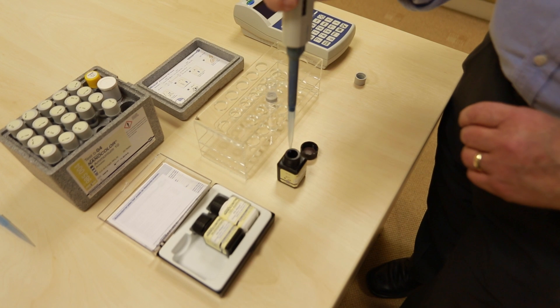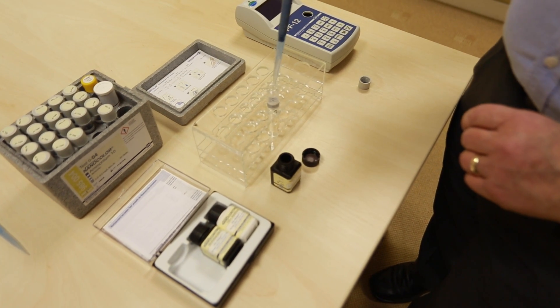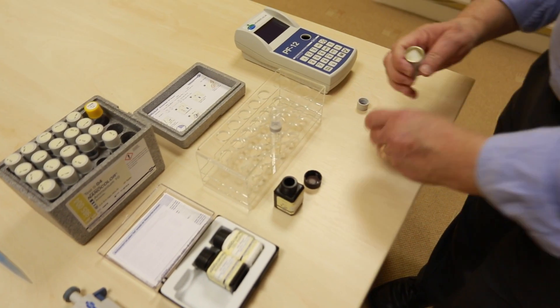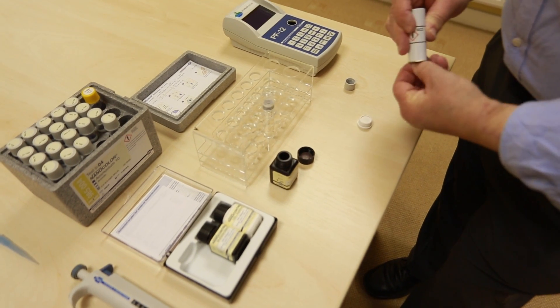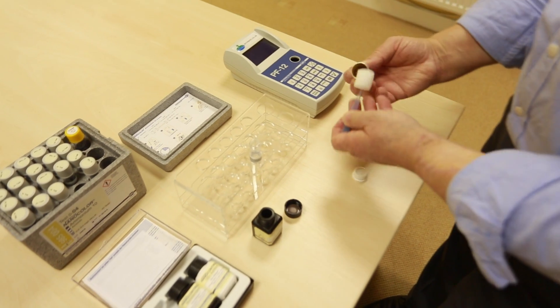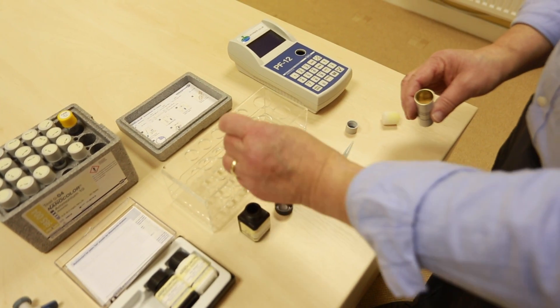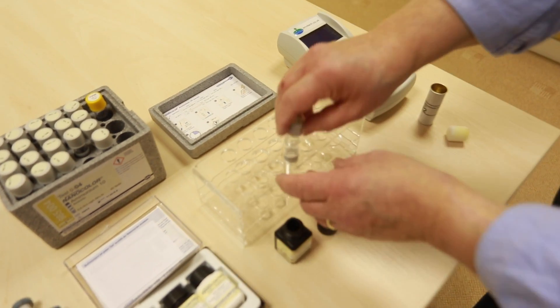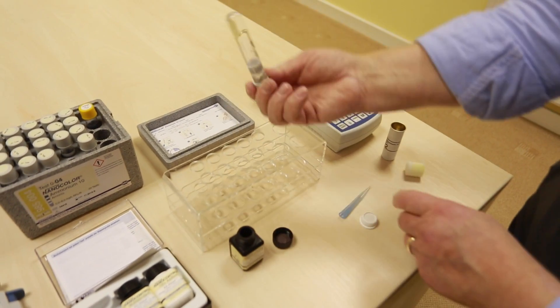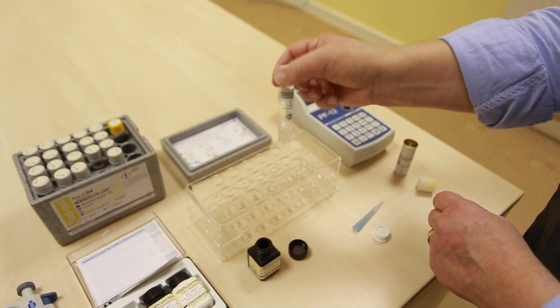Pipette 1ml of that sample into the tube. Add the solid reagent, which is freeze-dried into a plastic cap. Drop that in. Put the top on the tube and mix fairly well.